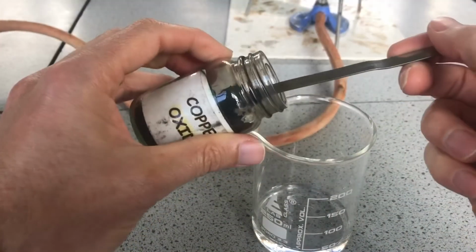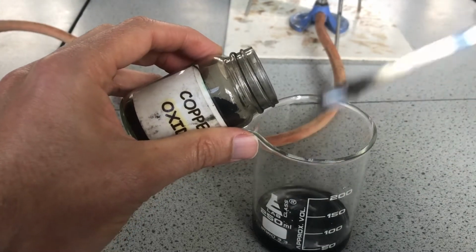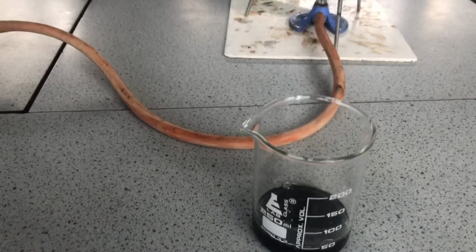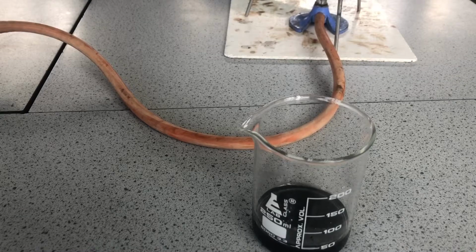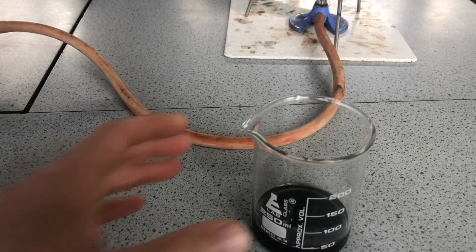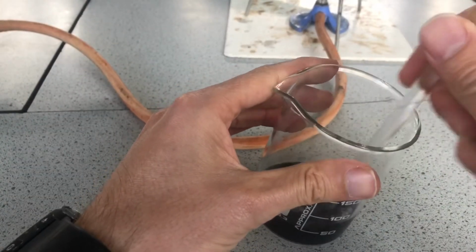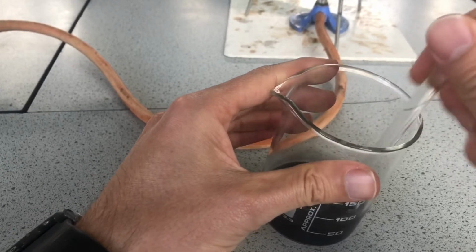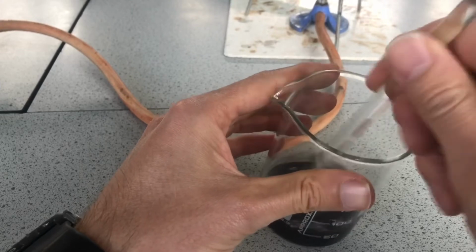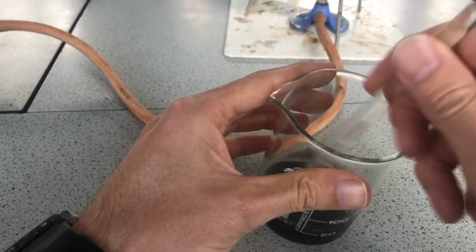Now, we need an excess of copper oxide, so we need too much. So I'm going to put in three spatulas, and that would be far too much, but that will ensure, hopefully, all of the sulfuric acid particles can react with some copper oxide. We're going to give that a stir as well, because that's how we ensure reactions happen. We can speed up the reactions. What we're trying to do is get every last one of those sulfuric acid particles to react.